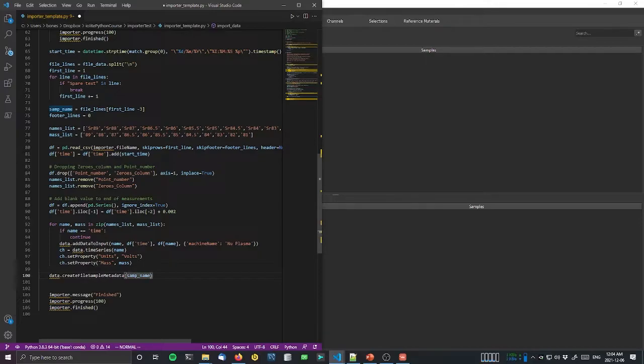We're going to pass it the start time. So we could pass it the start time, but remember that's in seconds, and it actually wants a date time object. So we're going to use date time from timestamp because it's in a timestamp format there. And then we're going to give it the end time as well.